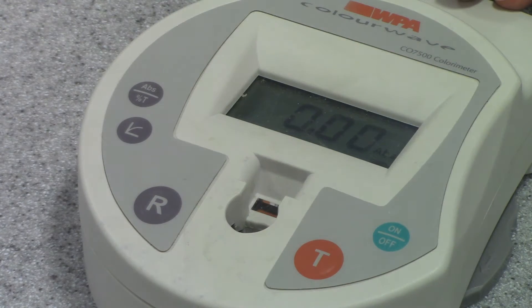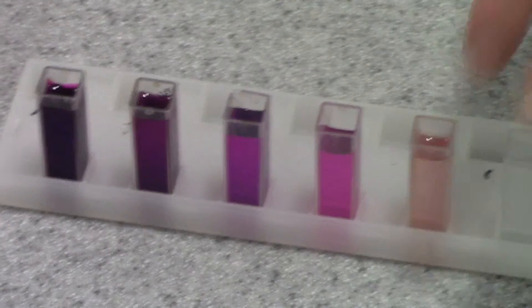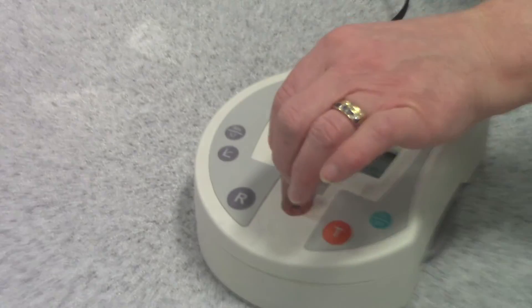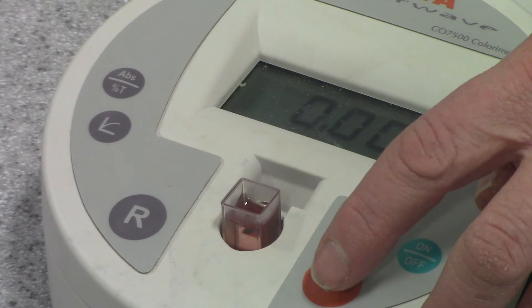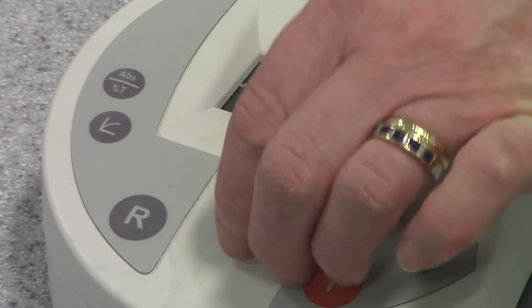I'm now going to prepare my calibration graph. So I've got a range of solutions of different concentrations. I'm going to take the first solution in my cuvette and I'm going to put it in and I'm going to press test this time. And this gives me an absorbance value, a numerical value that I can write down. I know the concentration of that solution and it's told me the absorbance.